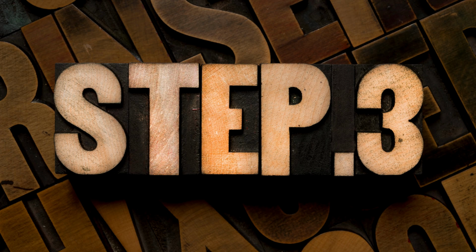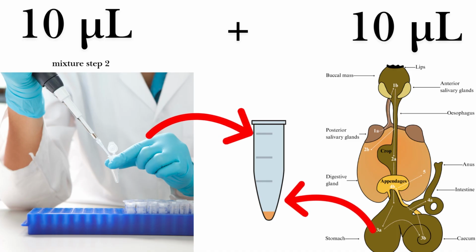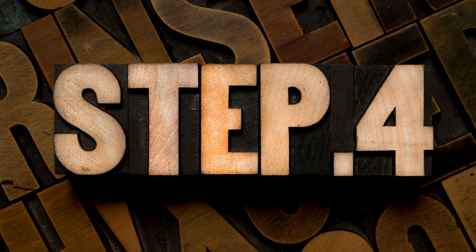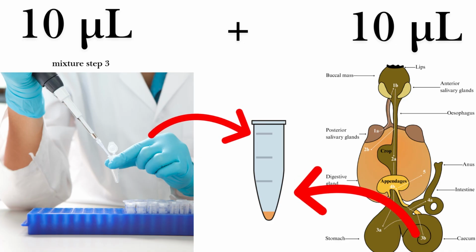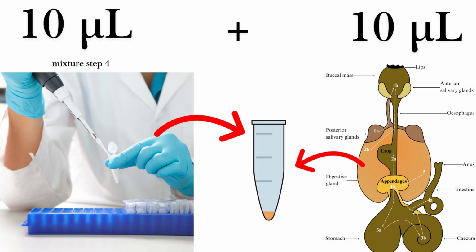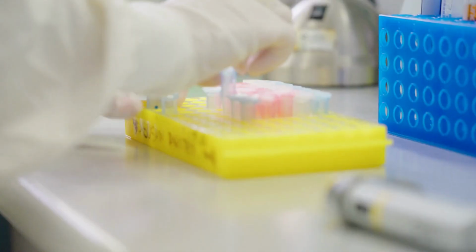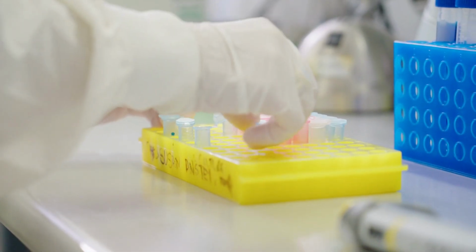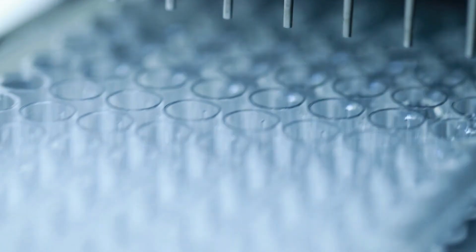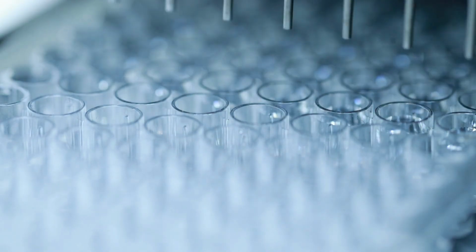Step 3. Repeat the process using gastric juice from the stomach and incubate for 25 minutes. Step 4. Add gastric juice from the caecum and incubate for 45 minutes. Step 5. Finally, add gastric juice from the digestive gland and incubate for 30 minutes. After the final incubation, a 10 microliters aliquot is taken to quantify proteins, cholesterol, and acylglycerides using the Bradford assay.